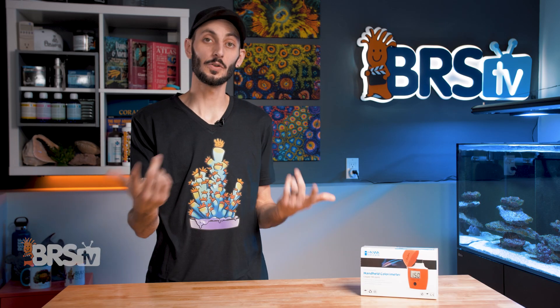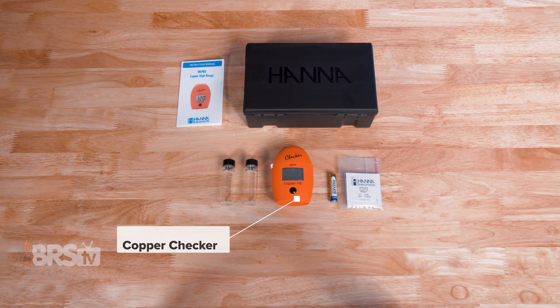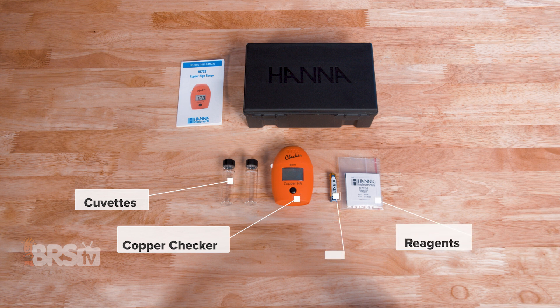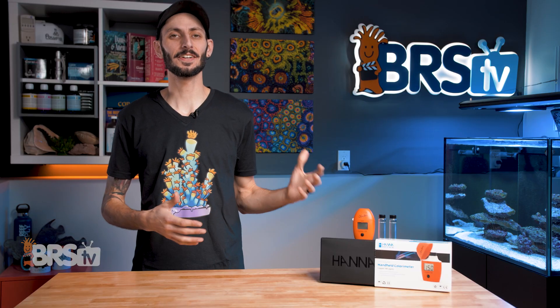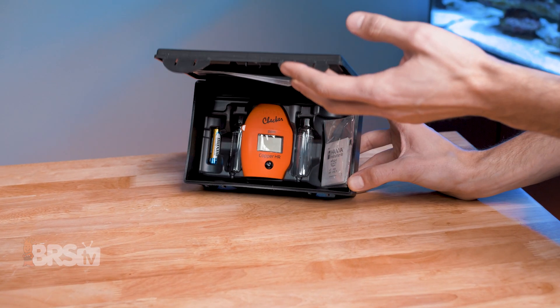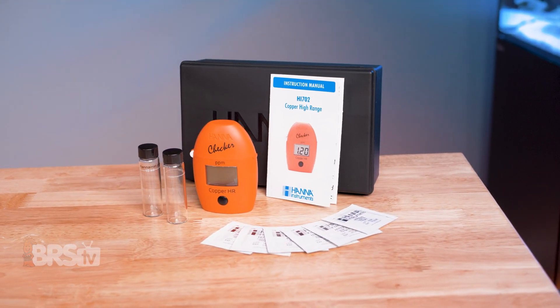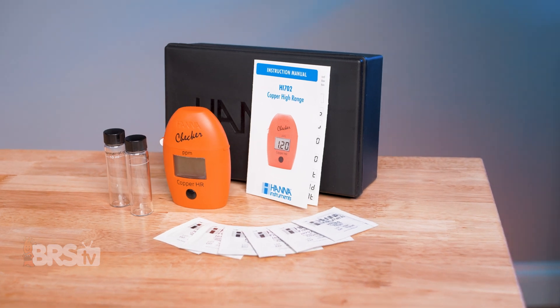So let's get it out of the box and then we'll do a test together. In the box, you'll find the copper checker, two cuvettes, a pack of six reagents, the battery, and a storage box along with the instructions. Hanna checkers are well known for their quality components and ease of use, and this copper checker is no different. You get a storage case, glass cuvettes with screw-on caps, and packets of reagent to get you started.